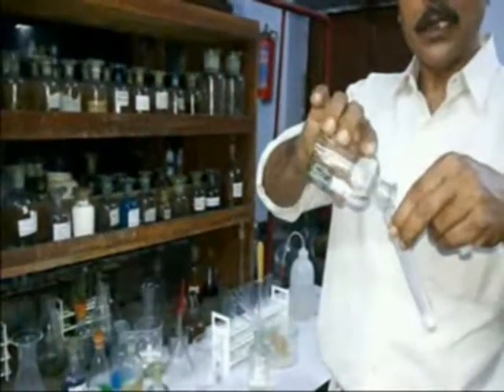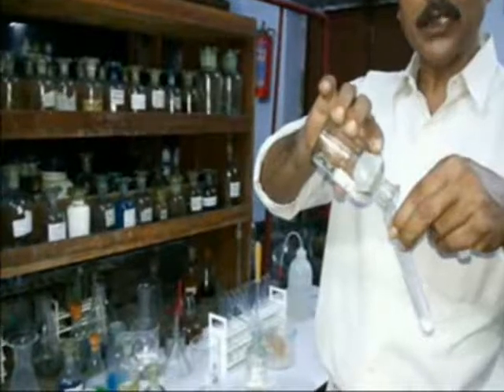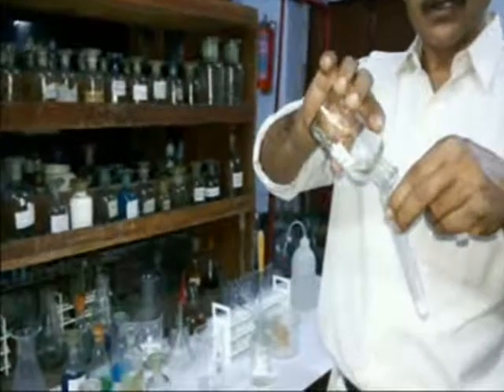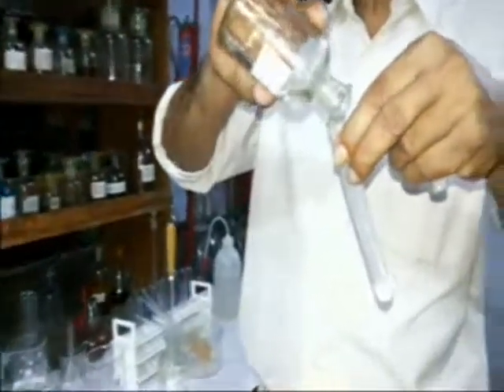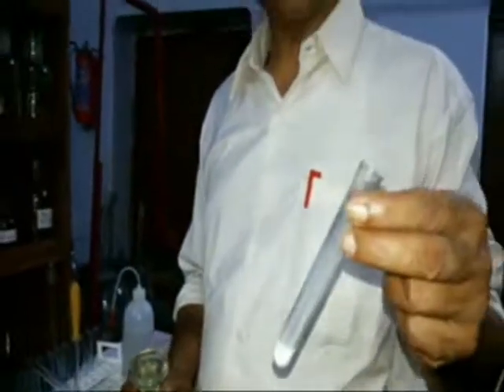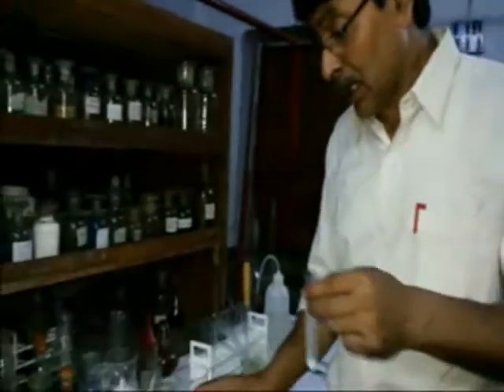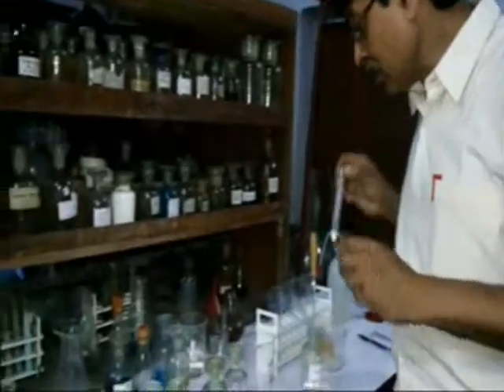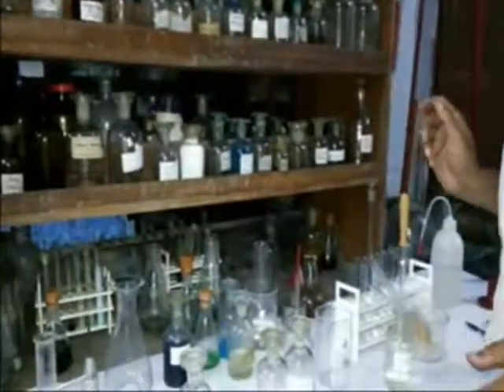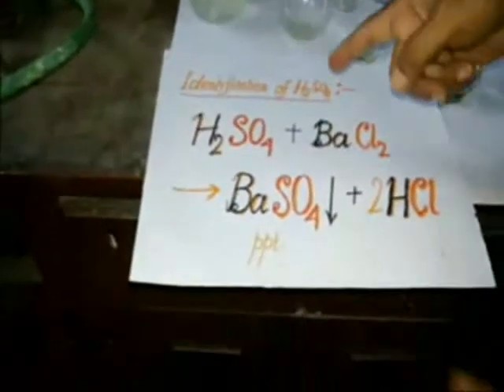On adding HCl to the solution, the precipitate does not dissolve. This confirms that the examined solution is sulfuric acid. Now watch the equation of the reaction — what is happening?